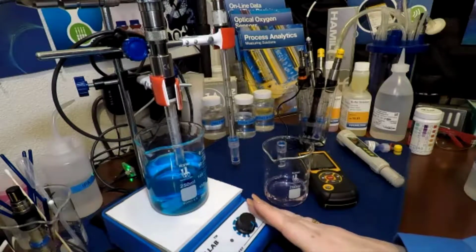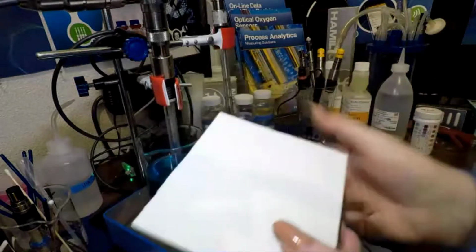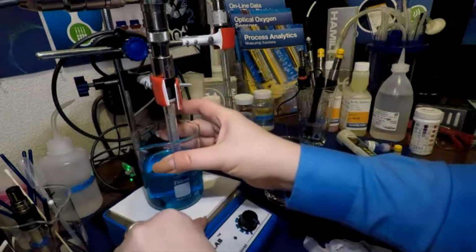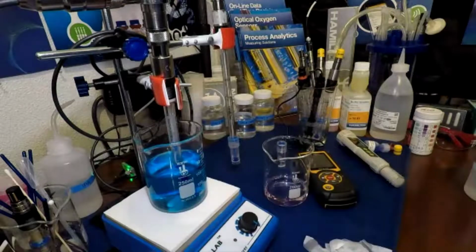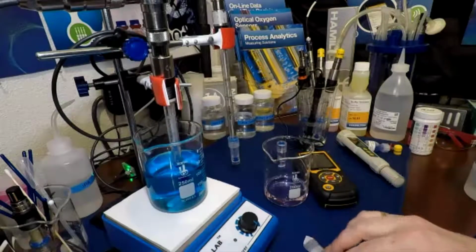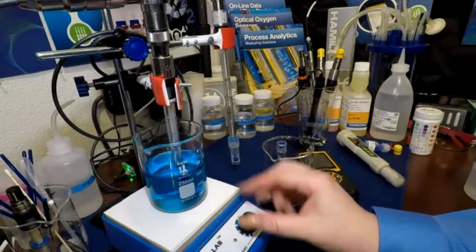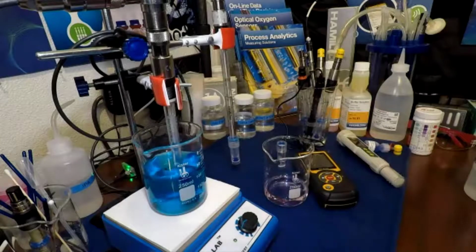Stirring plates will often add heat. So on my stirring plate, I have a thick foam that prevents heat transfer from my plate up into my solution. There are varying versions of that. There are insulating pads. If you have a heating stirring plate, you make sure that the heat is off during this. You want to make sure you're stirring. You need to keep that solution continuously stirring throughout the process. If you're not stirring, you're not going to get a good result.